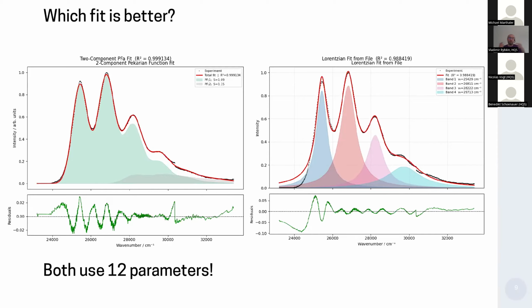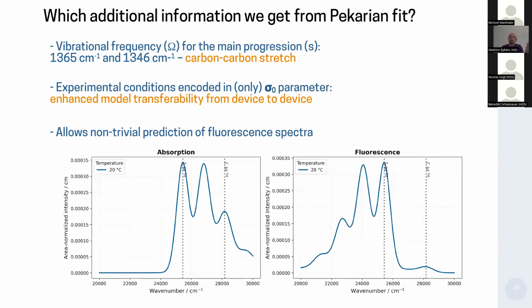One may say, so what? If I do mundane analytics, I don't need to know whether the line is vibronic or purely electronic. I just need to know where the maximum is. The maxima are correctly defined everywhere. Well, that's true and not true, because having a good physical model allows us to reuse the data and acquire more information.